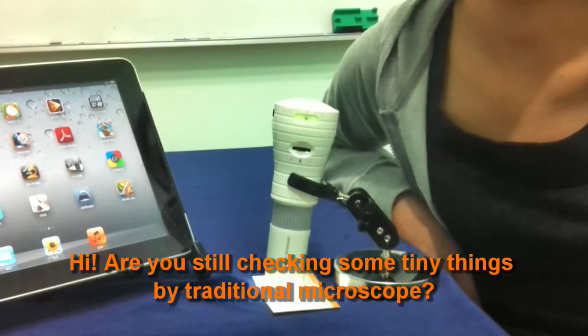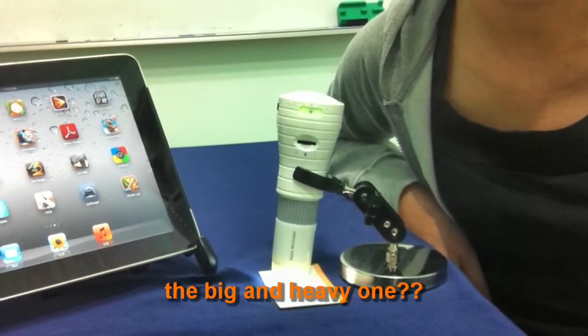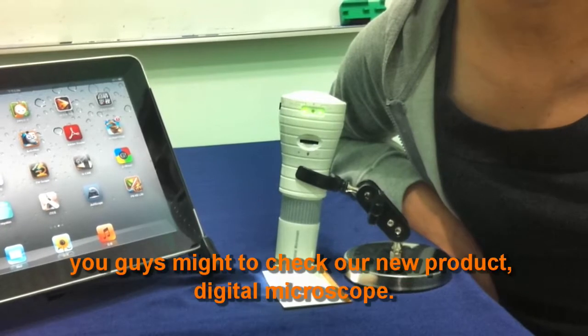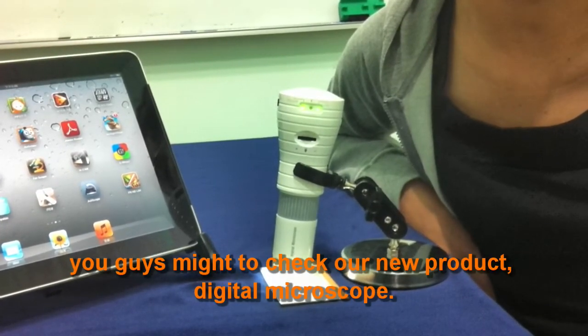Hi, are you still checking tiny things by traditional microscope? The big and heavy one, or the hand-held type you have to connect to a computer? You might want to check our new product: the digital microscope.